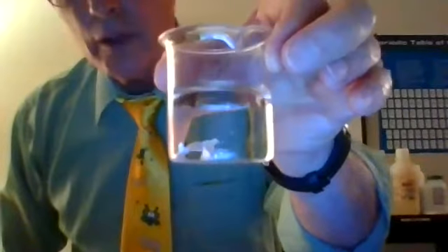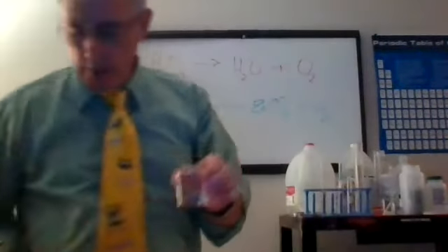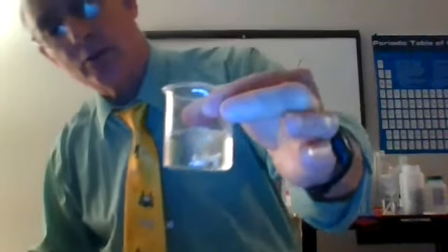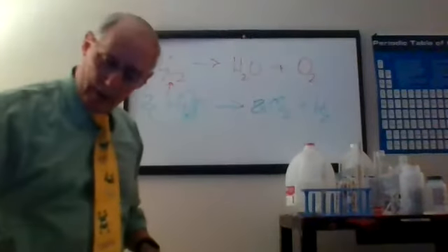Pretty slow. But what if you increase the concentration of the hydrochloric acid? Let's just add some more hydrochloric acid to this. Tell you what, I'm just going to replace some of the water. Now the solvent is diminished, and so we're going to stick some more of this acid in. A smaller amount of water. Now let's see what happens to that. You see that reaction occurring? Look at that gas coming off of there like gangbusters. Do you see it? Coming out pretty fast now, isn't it? And why is it coming out pretty fast? Because there was an increase in concentration of the acid.